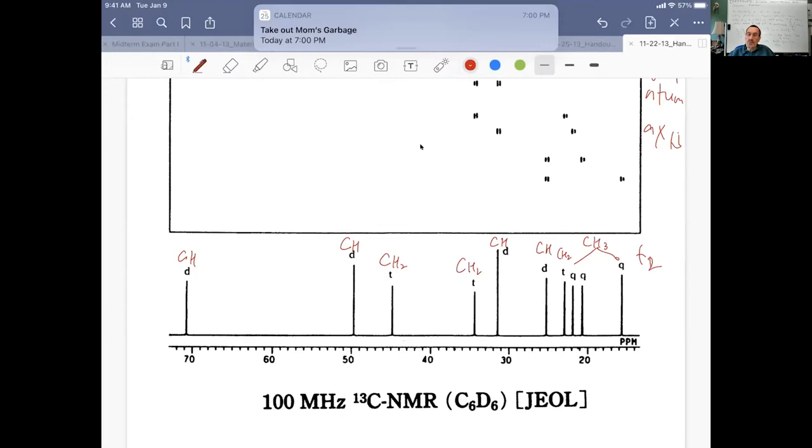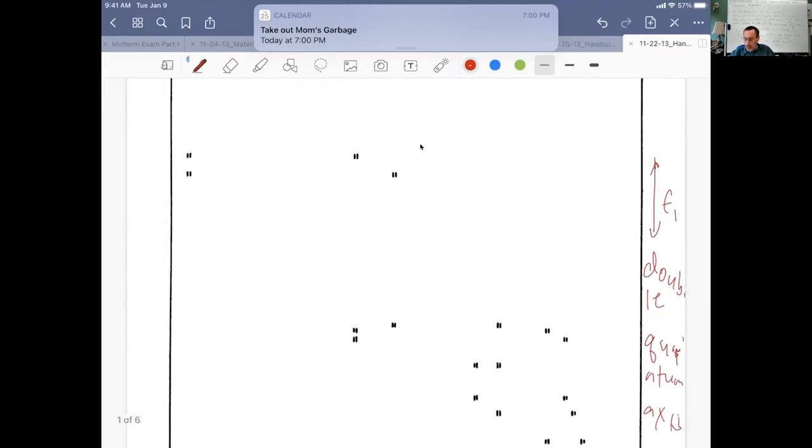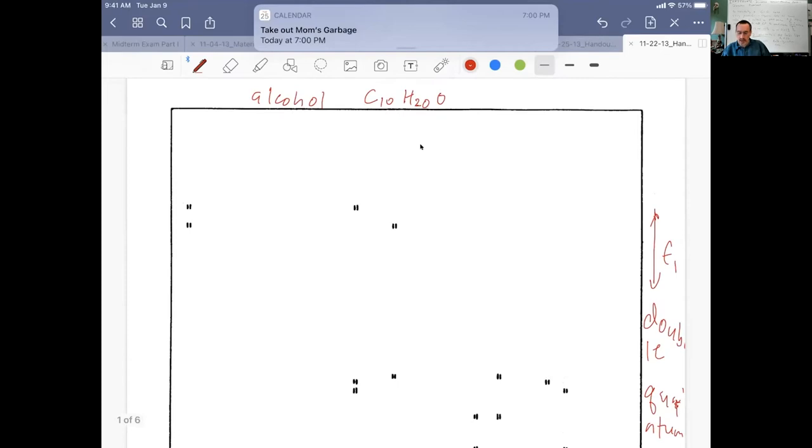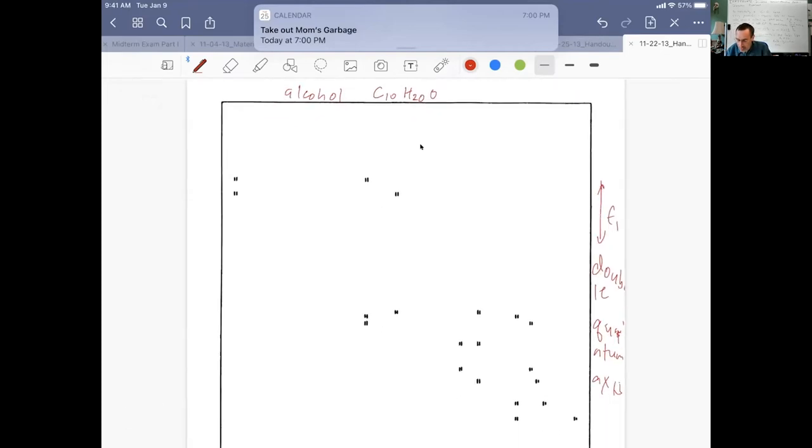The last three ones are all methyl groups here. What I've done for our whole course is say we're always going to deal with numbering our peaks in the carbon dimension. If we had peaks in the proton dimension, we'd letter our peaks. So this is peak one, peak two, peak three, four, five, six, seven, eight, nine, ten.